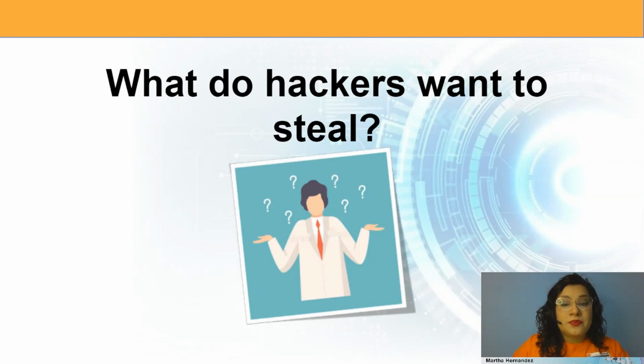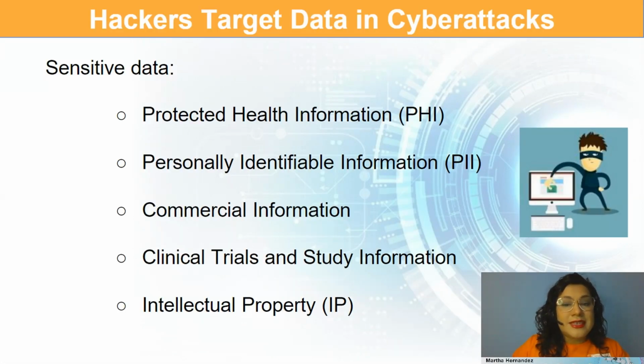Well, hackers target data in cyber attacks. Sensitive data is all confidential information managed by a laboratory related to a patient or a provider or client that should not be revealed to a third party, and that is only accessible to authorized users. There are different kinds of this sensitive data. It could be the protected health information, the personally identifiable information, the commercial information, clinical trials and study information, and the intellectual property. Let's see what those things are.